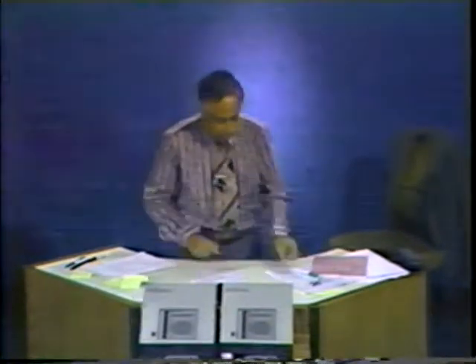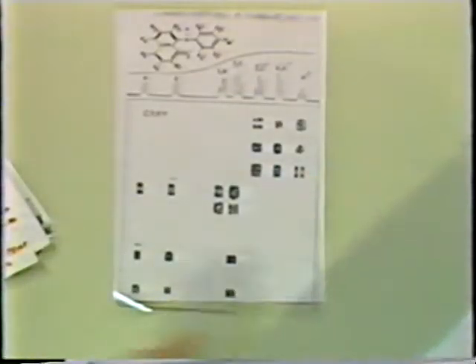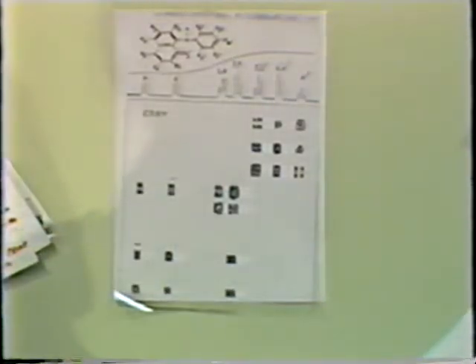Here we have an example of an application. A very simple one-dimensional spectrum, which you can record perhaps on an A60. The spectrometers that were designed in the 50s will give you a spectrum like that. The question is, which line belongs to which proton and which ring, for example. You would have to do some decoupling experiments if you wanted to sort out which line belongs to which proton and to which ring.